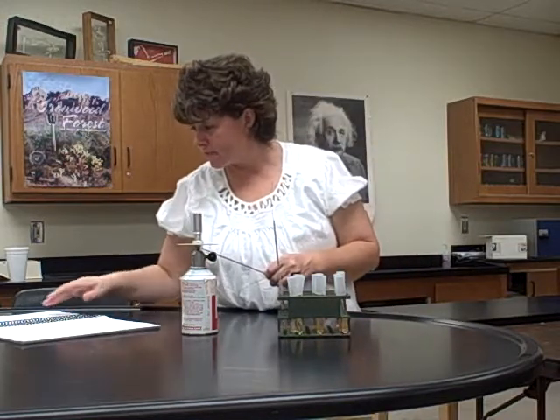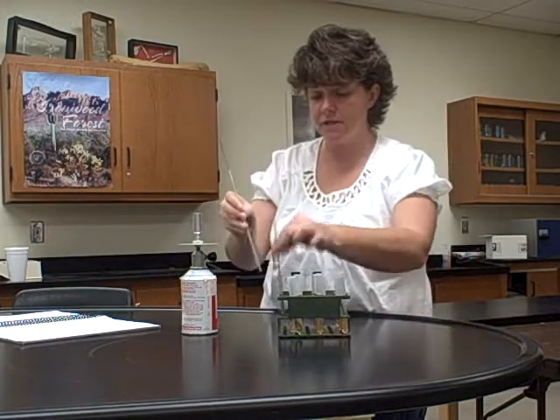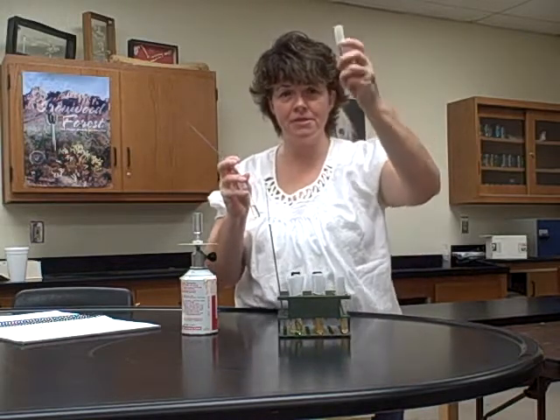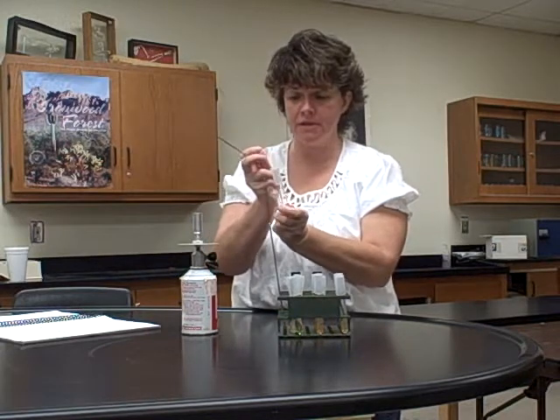Now the third one is going to be the deep. And for the deep, you're going to use your needle. So we flamed this, we've sterilized it, now we're going to use our needle. So the same thing, we have our culture that we're taking from. Now this is the semi-solid agar deep. At this point, we're actually going to stab it into there.